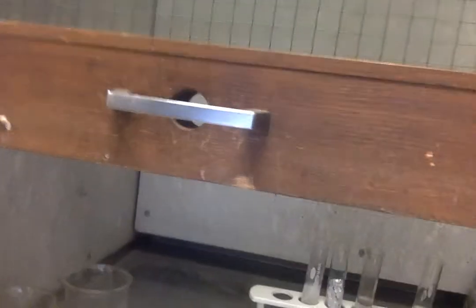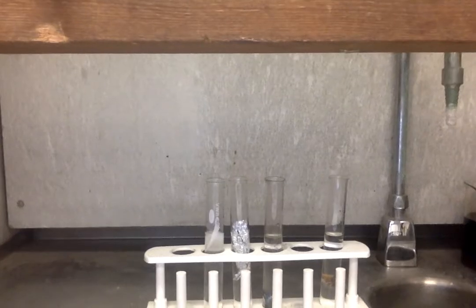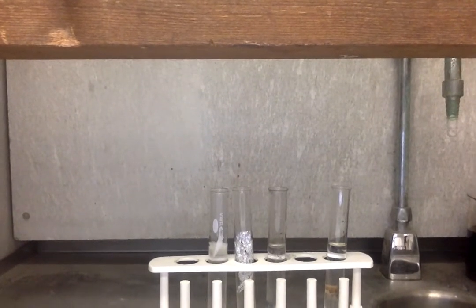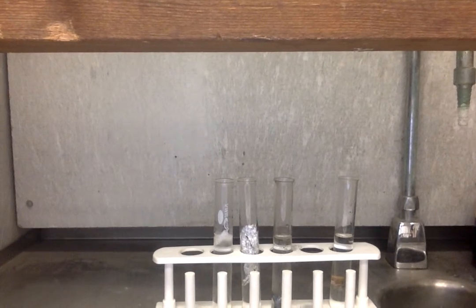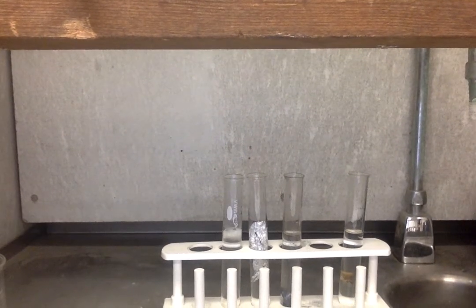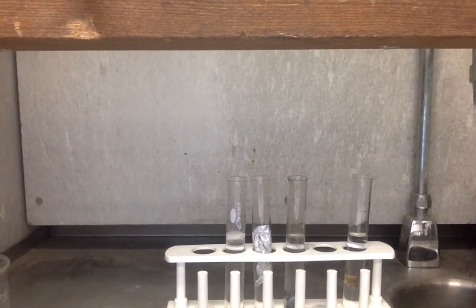So, adding the aluminum to the acid, and then adding the magnesium to the acid. Might be difficult to see. I think I will have to open the fume hood. But immediately, when I added the magnesium to the acid, we had a reaction right away. We're starting to see possibly something happening with the aluminum. Let's get back to that in a little bit.